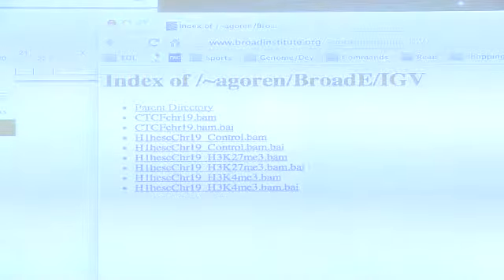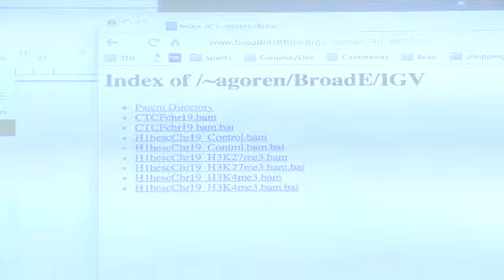So we're launching IGV from the space? It does. It's not necessary. You can just go to IGV itself, but just use the software, which can be done like this.